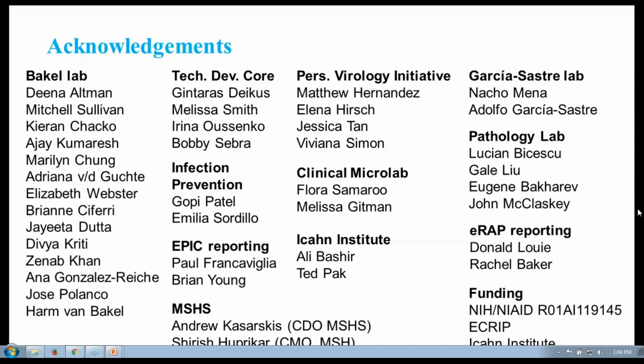Great, thanks. Question for you, Harm. It's interesting to see the extent of structural variation in the MRSA strains you sequenced. Do you have a sense of how much virulence is mediated by SNPs versus structural variants? So we haven't really quantified that yet, but what we're doing currently is integrating genomic data with phenotyping data, and relating the changes in the genome to changes in phenotype. We hope that's going to give us a better impression of how big the contribution of the accessory genome to virulence is.